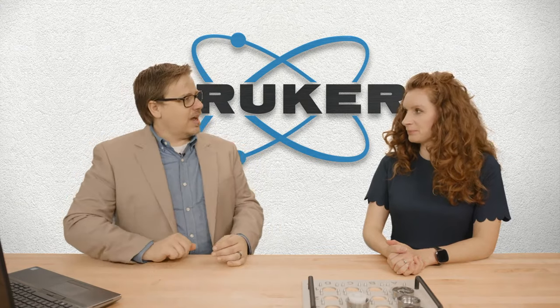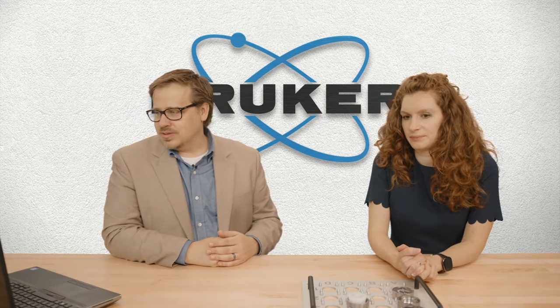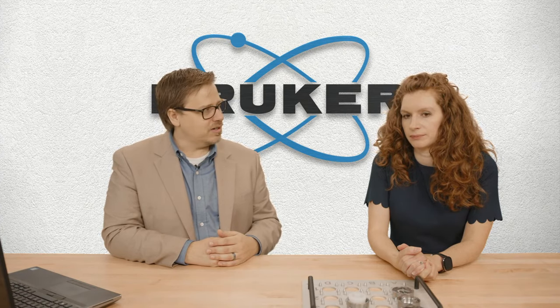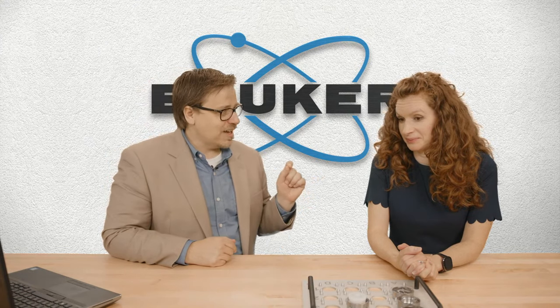So we're gonna get to the hard questions for you now, Julia. The first question actually came in right before the broadcast from MasterMelt. Can this technique be used to determine the portion of the total carbon in cast iron? And I'm gonna throw you for a little bit of a loop here, existing as graphite.